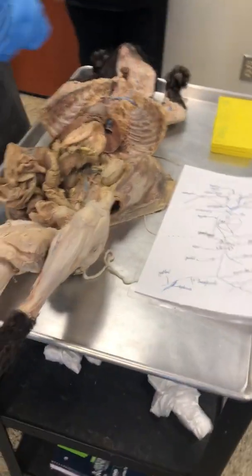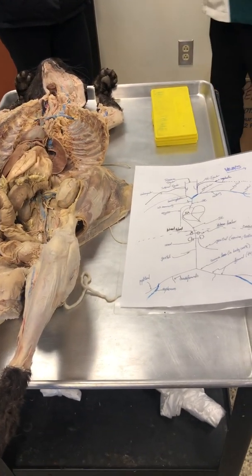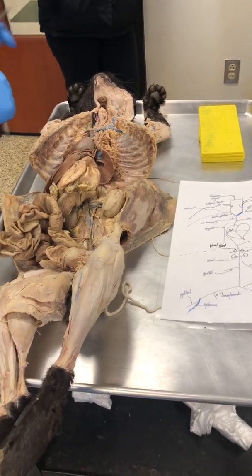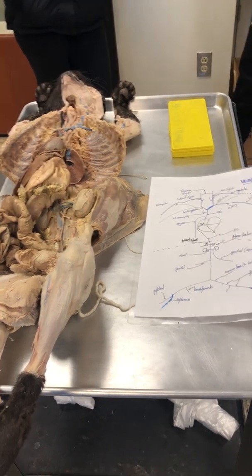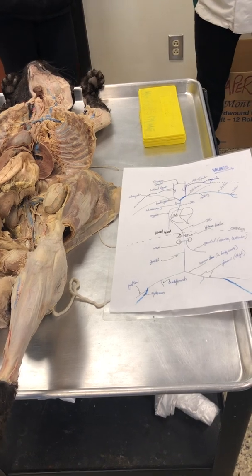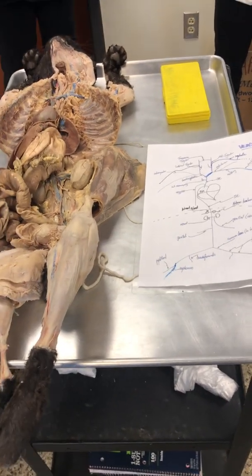Now, what happened here, folks? So let's talk about this. And again, the respect for the animals, the fetal pigs, lots of them. And here's the thing too, people, in that bucket, unfortunately, Brian, now we're getting rid of the pregnant cat. We kept her for a long time. Then I put in preservative, but now we have to get rid of her.